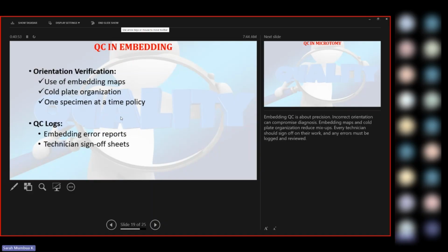you do a quality check. Are my tissues well embedded, oriented? If it was circular, is it well placed? Are all areas of that circle, like the eye, being seen? You have to make sure all parts of that eye are being seen. If it's tubular, like the fallopian tubes and even the intestines, make sure all levels are being seen. If it's skin, for example, skin has layers. Are all layers able to be viewed by the microscope? So this is very key.